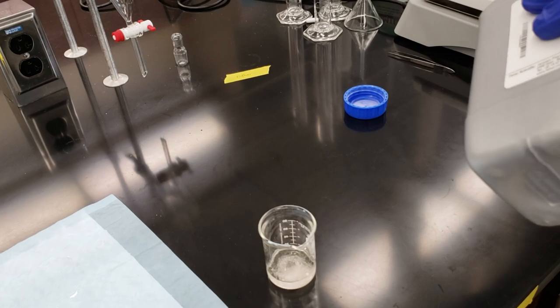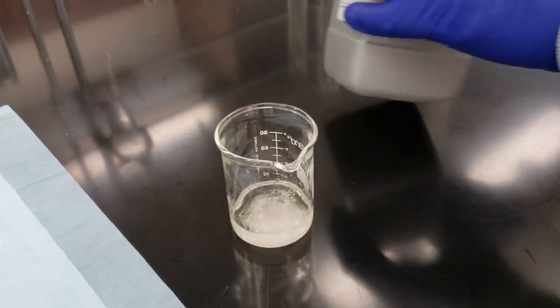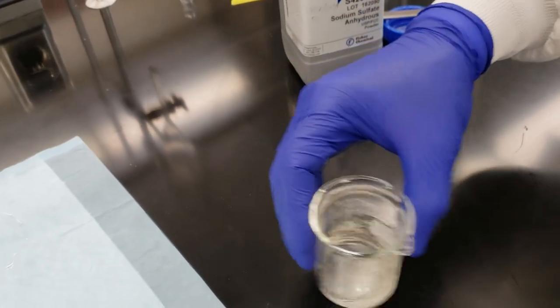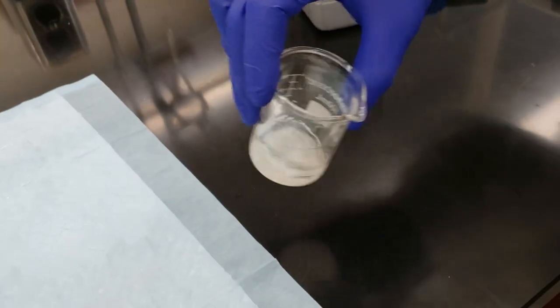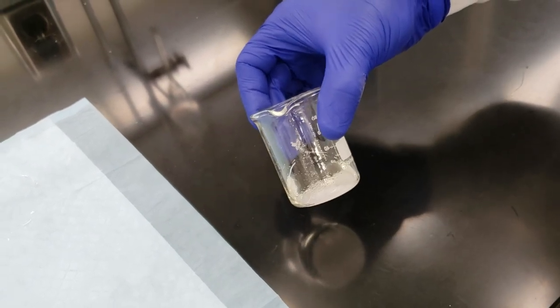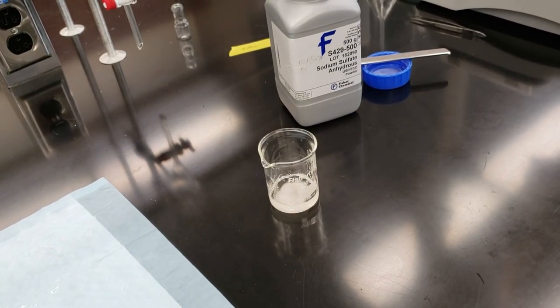What we're looking for, just like we have in the past, is free floating powder when we swirl. If you want to look down into the top of that, we can actually see that some of the powder is floating freely, so it looks like we've aggregated all the water in our solution. Okay. We're going to leave this to continue to dry for a few minutes as we get our column ready for the next purification step of our reaction.